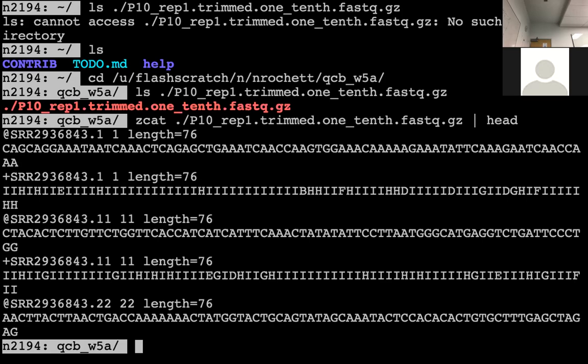First of all, you're on the login node, so that's the immediate issue. If you're working on the computer, you really want to use qrsh. If you go back to the usage of Hoffman2 slides, you need to exit.